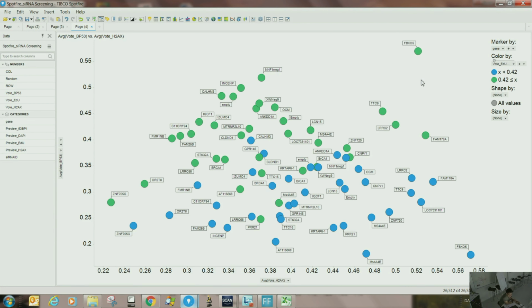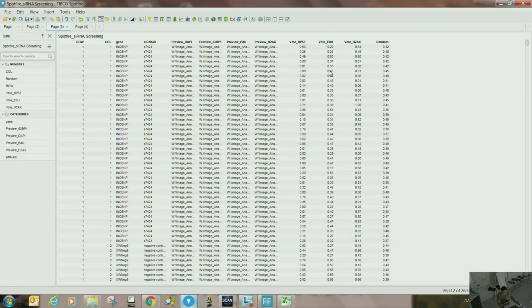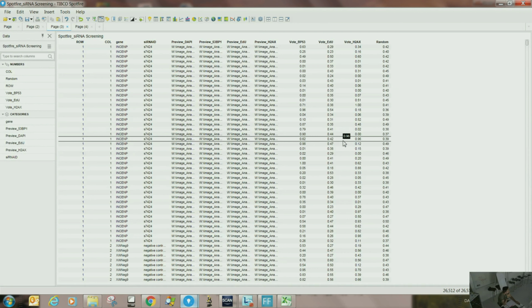Okay. But now you got it, right? And then you can actually use a shape as information about, let's say, here it's only based on one cell and one image. So every feature is a cell-based feature. We haven't aggregated. Now we are aggregating in Spotfire, but the file I showed you, every row is basically a cell, because you were always shown only one cell, right?